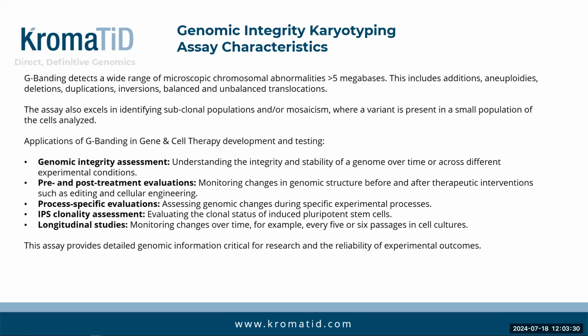Applications of this in the gene and cell therapy space are genomic integrity assessment, so understanding the integrity and stability of a genome over time or across different experimental conditions. So for pre and post treatment evaluations, this could apply to a research batch of donor to an edited cell. It could be in a different stage of your process, so an engineering batch, for example, or even final drug product.